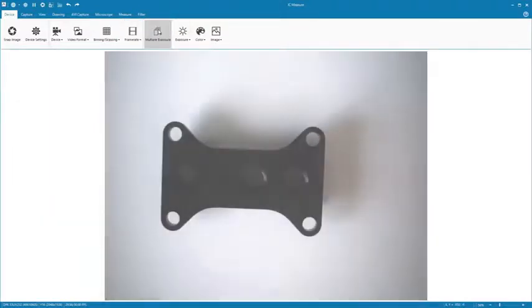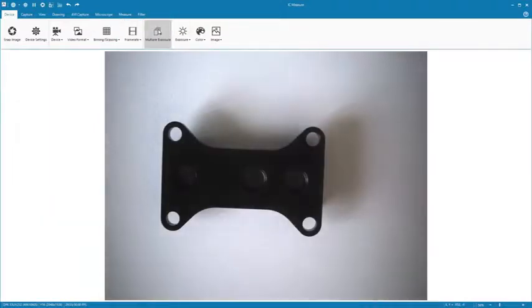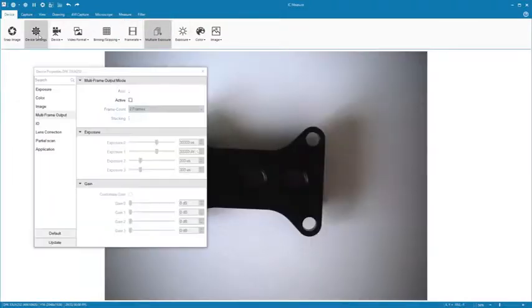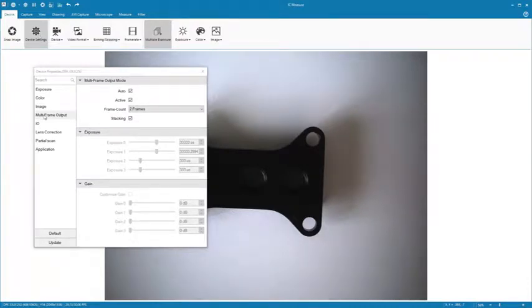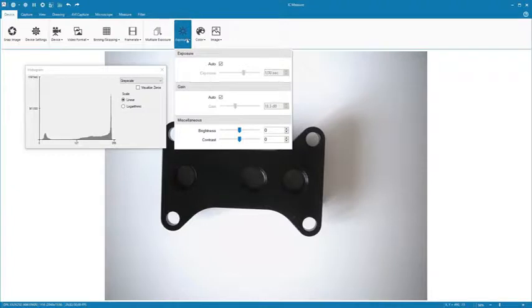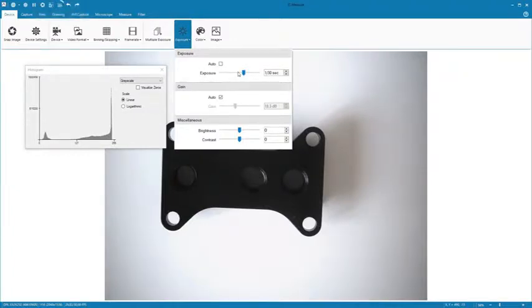By using multiple exposure, you can increase an image's dynamic range and automatically create HDR images. Under Exposure, adjust brightness and contrast. You can also display a histogram for additional visual support.